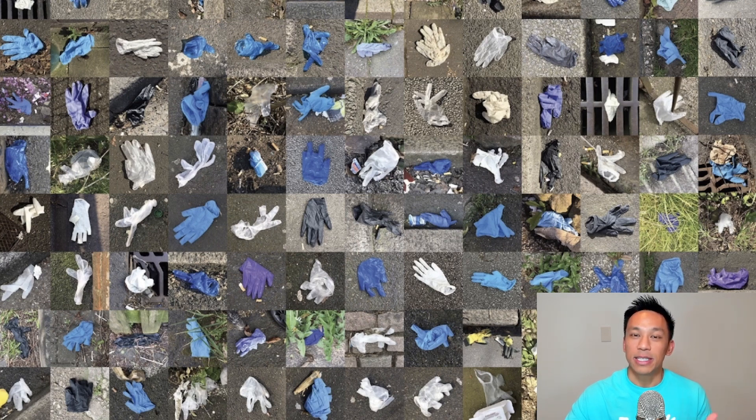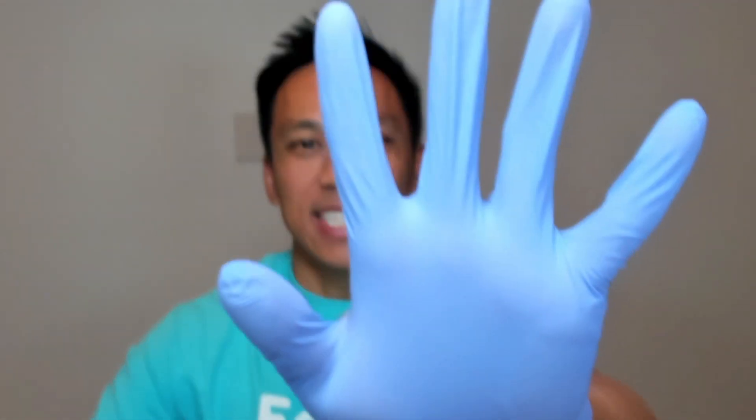That includes different safety certifications and different tests that need to be done. This is actually a biodegradable nitrile glove. You'll see that it's almost identical to a standard disposable glove, and in most cases, you wouldn't even be able to tell the difference.